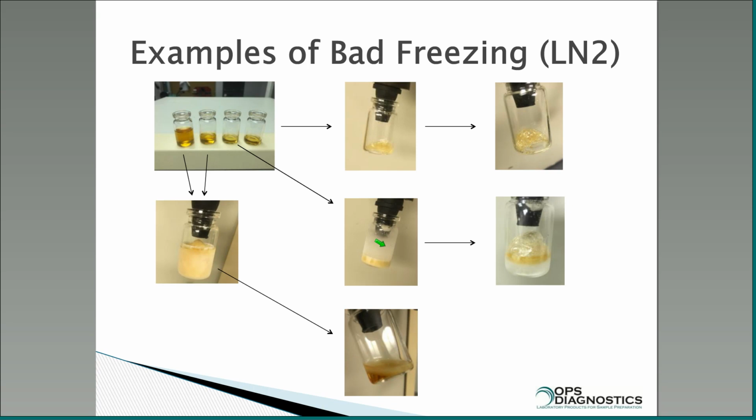Here, this looks good. You can see it's frosting over, but since it was frozen using liquid nitrogen, a lot of little ice crystals. It's flat, so it started going pretty well, and then towards the end it started to melt. What happened is initially some melted underneath in the bottom, and when you got the liquid there, it formed gas, and it actually pushed the dried cake up a little bit, and then some of the water on the top melted, and when that happened, that bubbled up and formed a film.